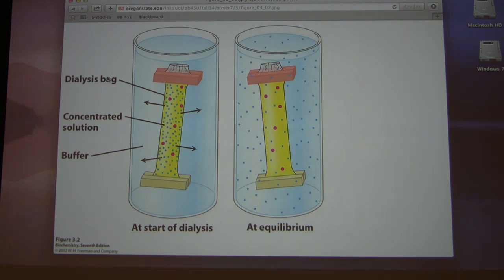I might say, okay, let's use that concentration. We'll form a precipitate, we put it in the centrifuge, and we take the liquid away. We've gotten rid of a lot of things that didn't precipitate. When I resuspend my protein so that it now goes back into liquid, then I want to get rid of the salt. This method would allow me to get rid of the salt.